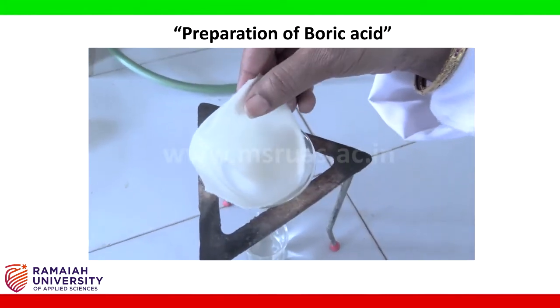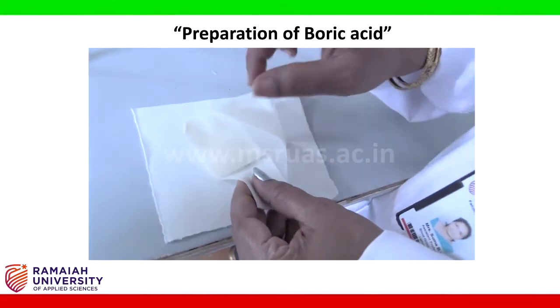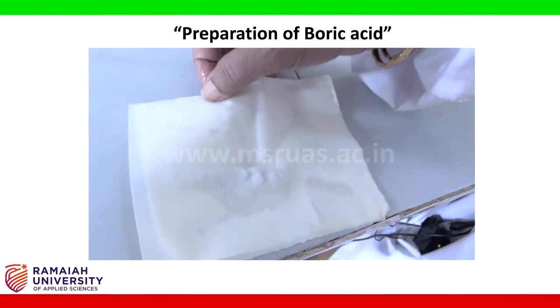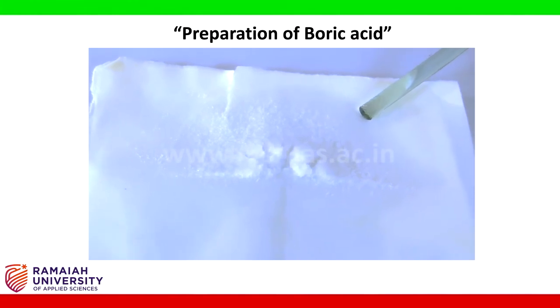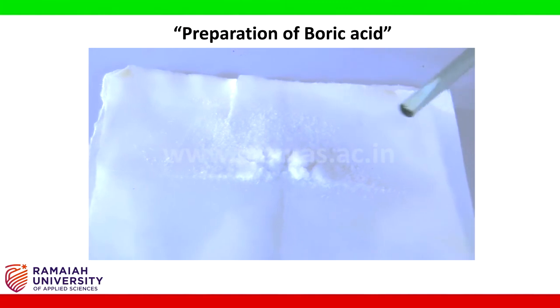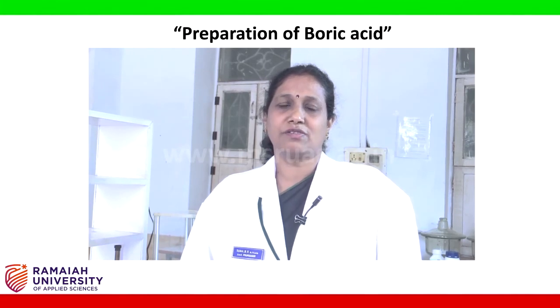After the filtration process, we'll take out and dry the crystals. After drying the crystals, submit the dried product of the boric acid in a self-sealing pouch with a neat label. This completes the experiment, the preparation of boric acid from borax.